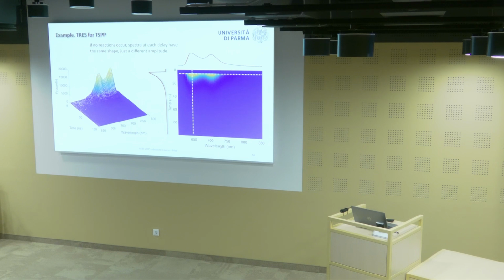And if the system changes after photoexcitation because of a phototransformation, you may be able to see not these very nice single decay plots, but you may see bands appear somewhere here. As we saw, I believe, this morning in one of the presentations where the absorbance was changing. This is fluorescence, but it's pretty much the same thing.